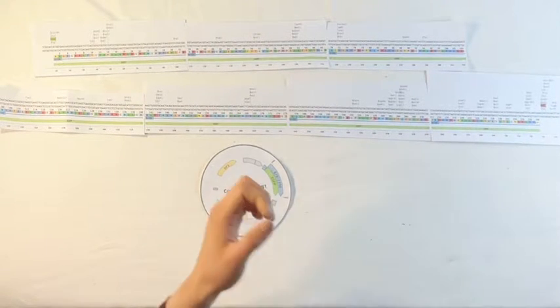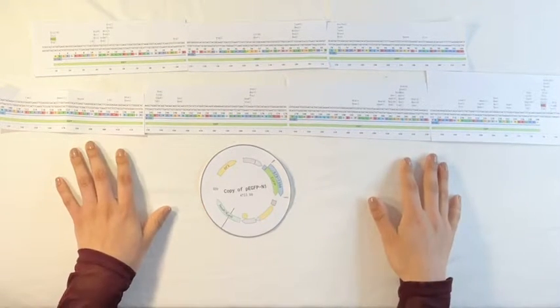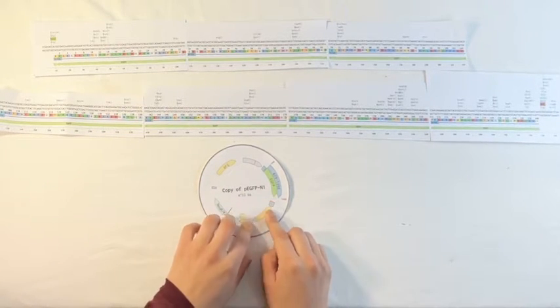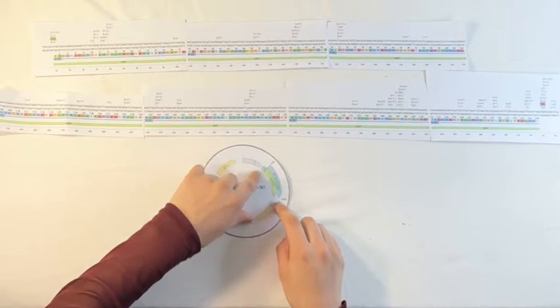Now we're going to go over what's actually occurring within the PCR reaction. We're going to start off with our pEGFP-N1 plasmid, and our goal is to only amplify this EGFP gene segment.